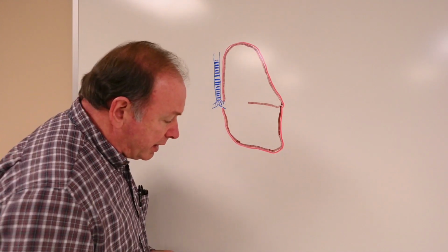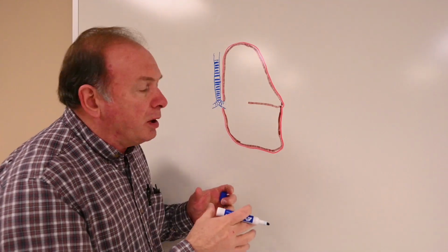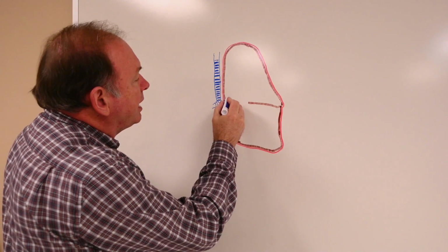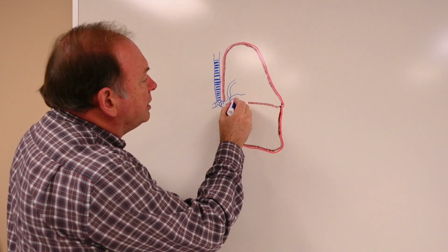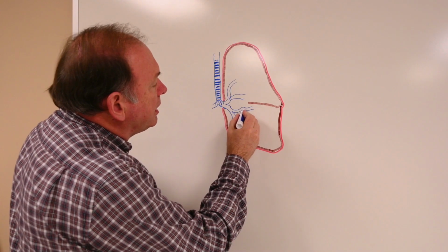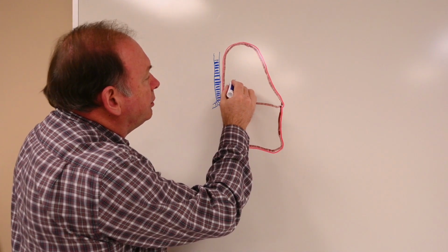The rest of the lung, when we look at it, we want to look at it in portions according to how far we are from the entrance of the primary bronchus here. So a bronchus comes in and it starts branching out through the lung. So we have primary bronchus and we have secondary bronchi that reach out into the subparts of the lung here, and then tertiary bronchi out beyond that. So these are our major lung passages branching out through the lung.